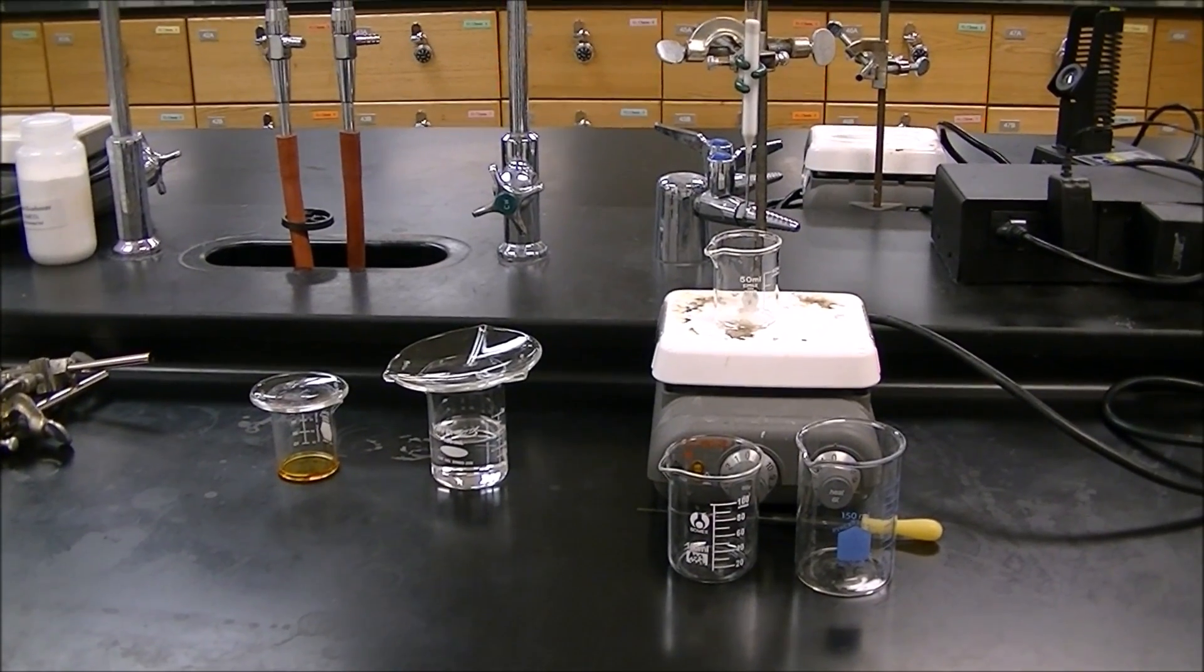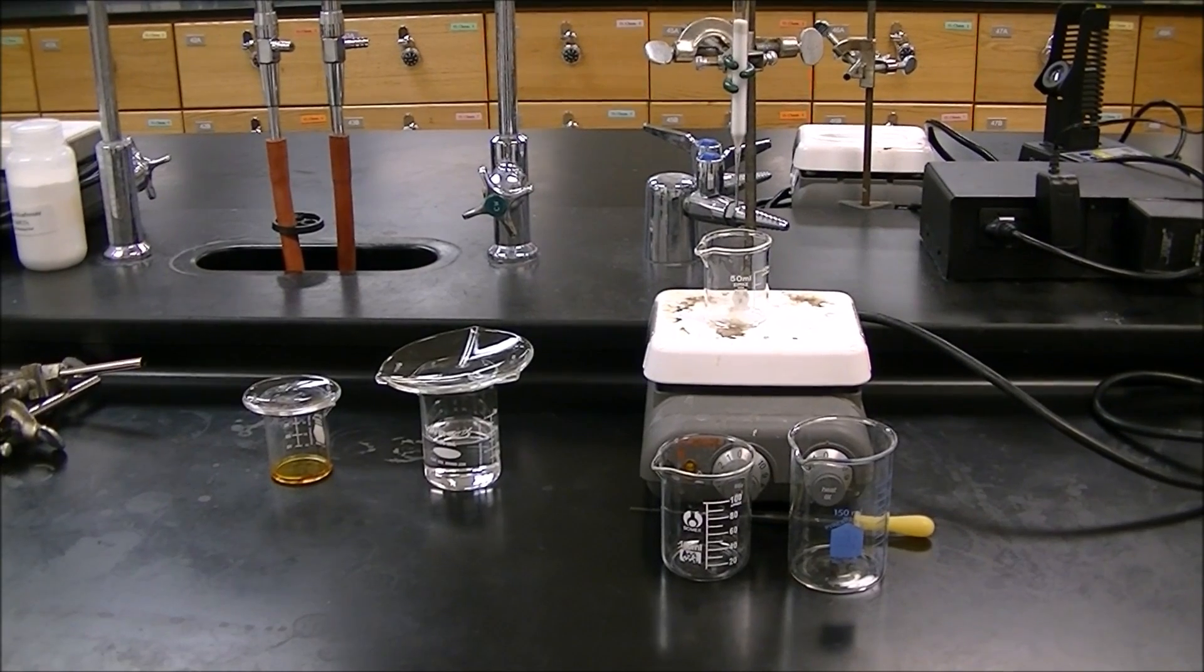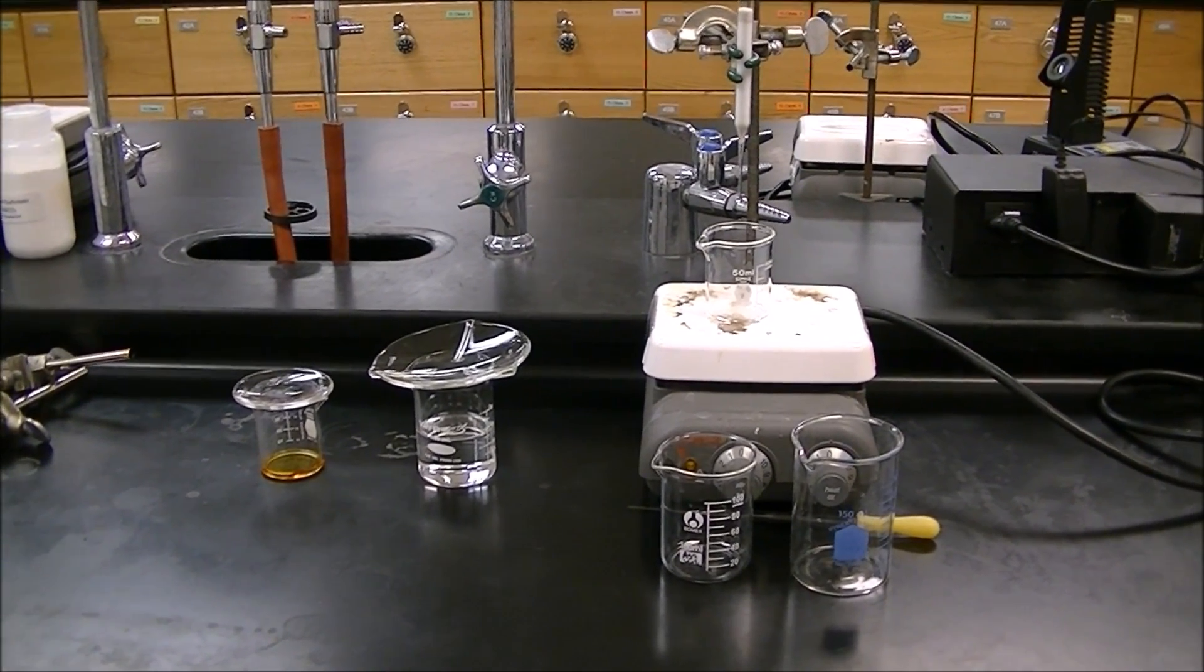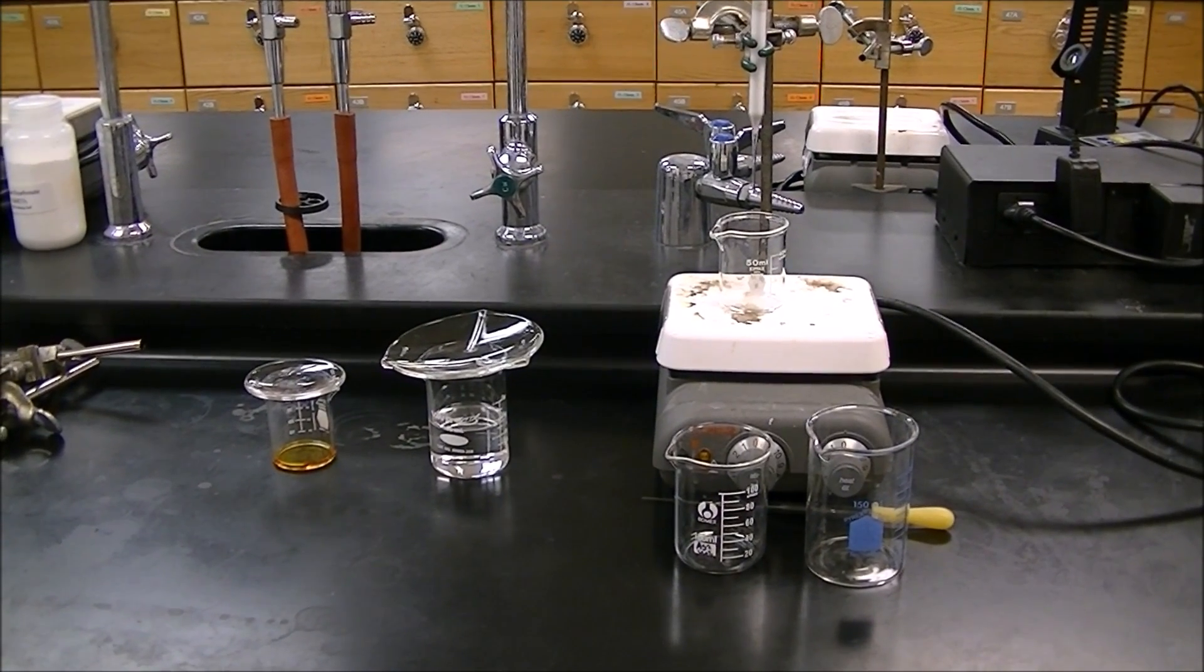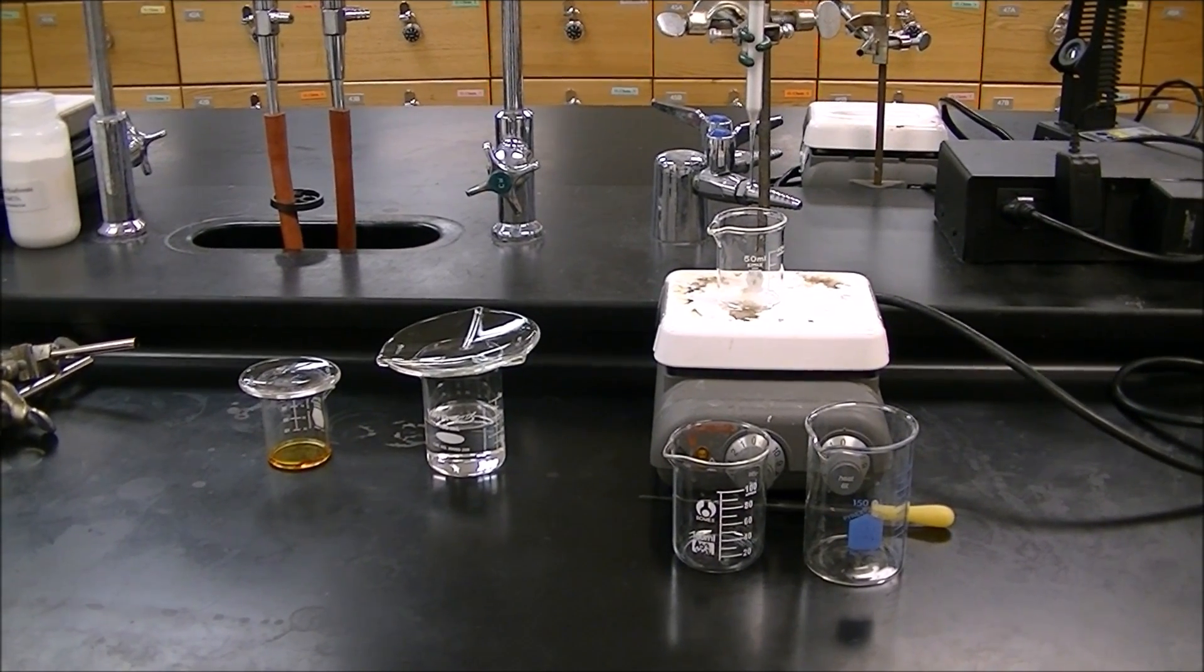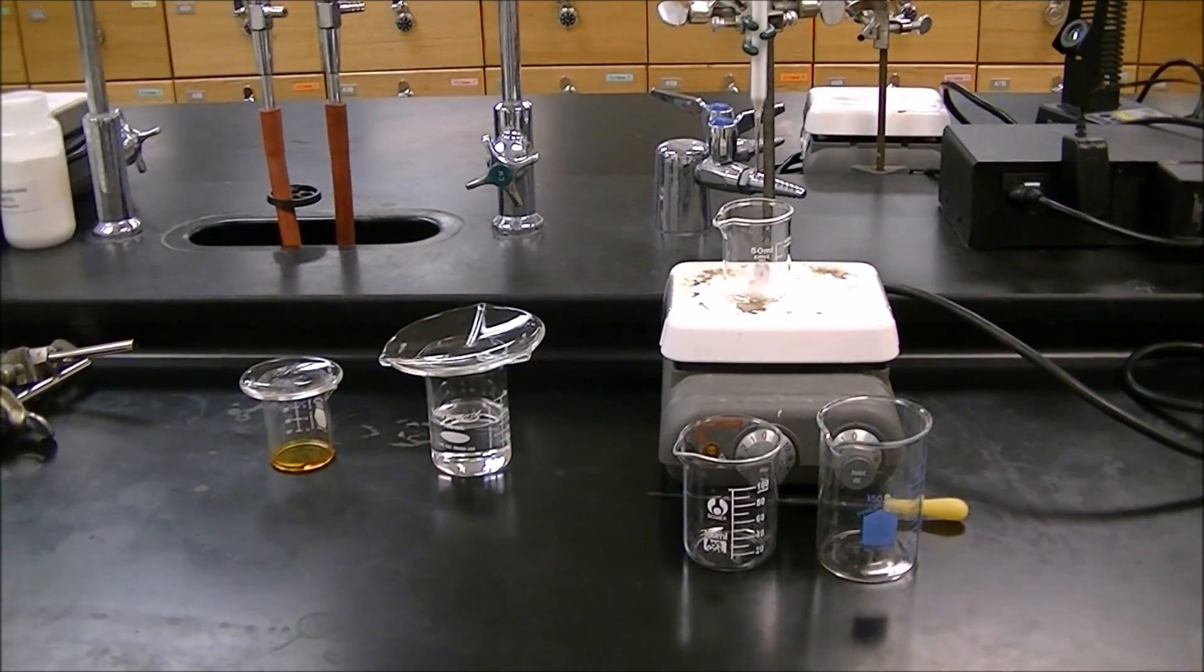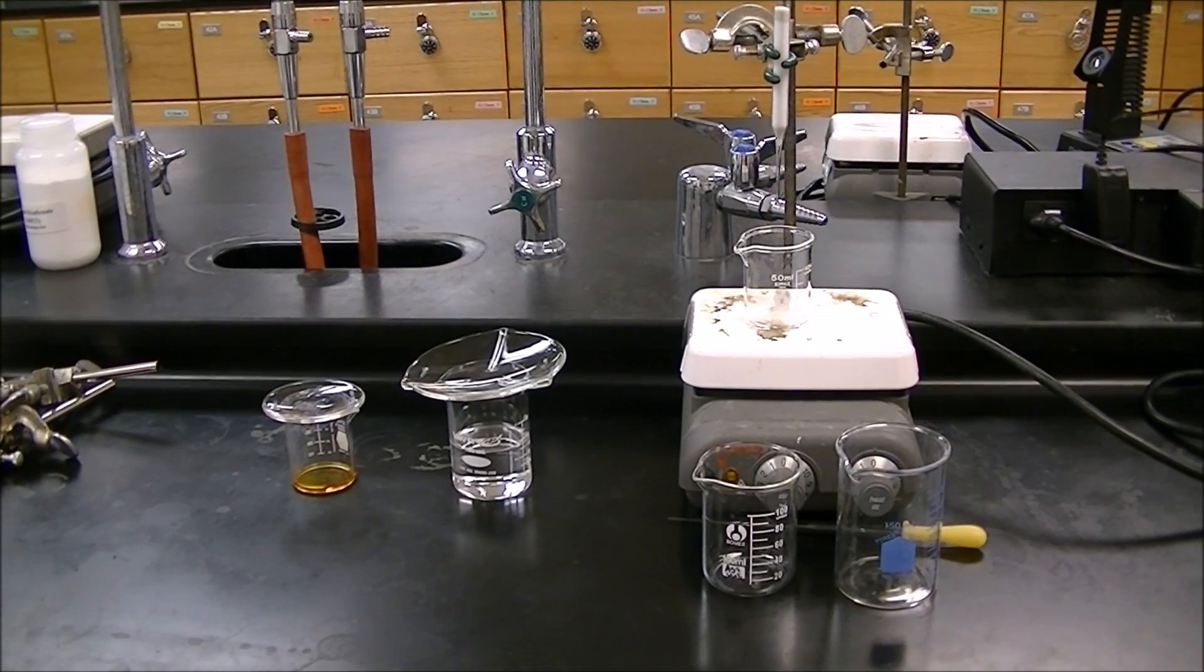Now we're ready to start the separation through the column. We have our concentrated azobenzene mixture on the left there in orange. We have our 99 to 1 hexane and methanol solution. We have a couple extra beakers down here for our separate collections of the different bands that will come off the column.